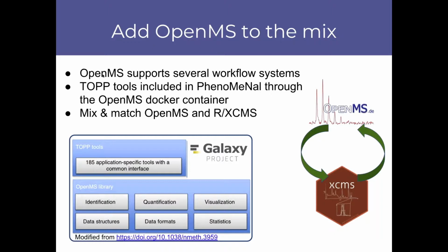OpenMS supports several workflow systems, so it can be run not only inside Galaxy, but also in KNIME, which is another popular workflow system. The OpenMS tools are called TOPP, the OpenMS proteomics pipeline tools. And they have been included in Phenomenal also through the OpenMS Docker container.